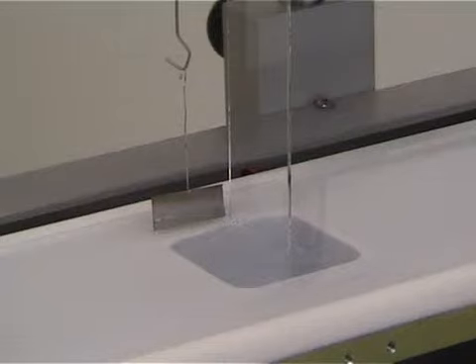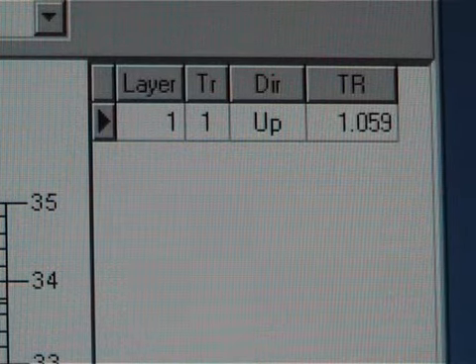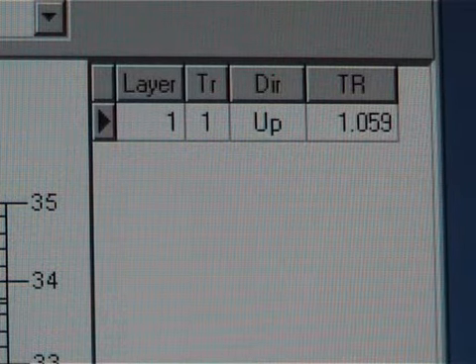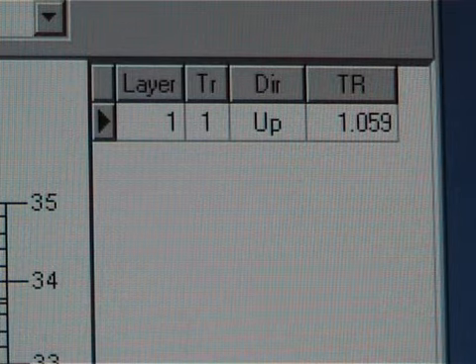Once the measurement is done, the transfer rate will appear in the TR field.